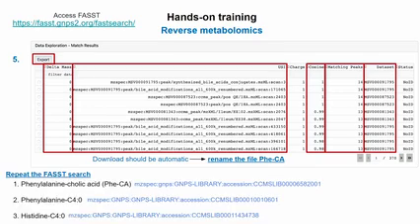So now what we want to do, for this workshop, is focus on 3 molecules. We did it for phenylalanine cholic acid. We want to repeat this for phenylalanine C4 and then histidine C4. You could repeat all these steps which I explained earlier using this link.